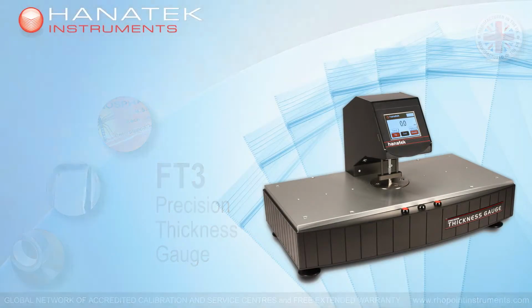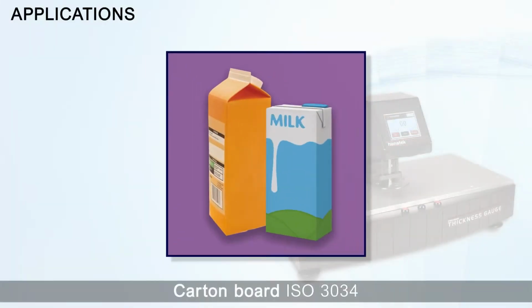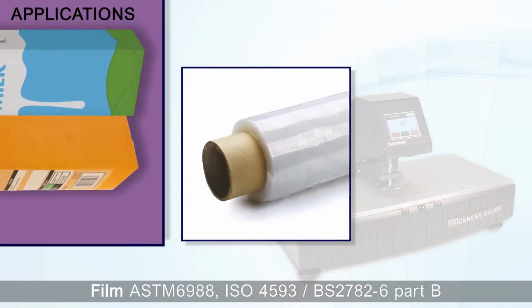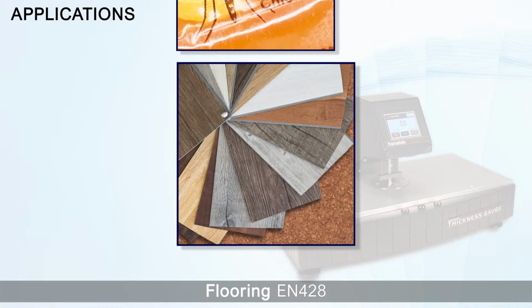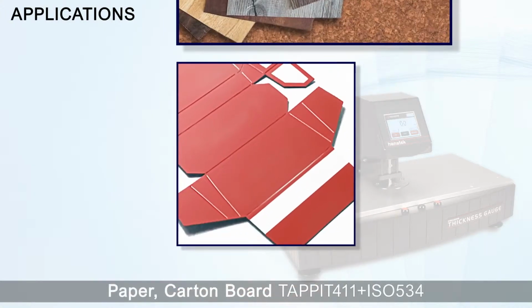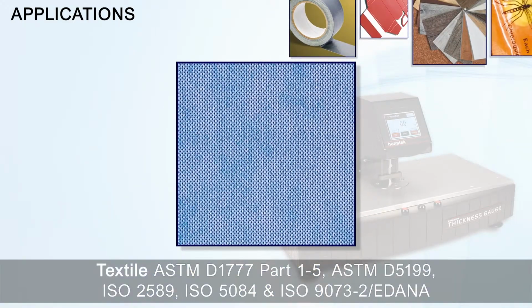FT3 Precision Thickness Gauge. Accurate and repeatable thickness measurements. Compliant to multiple standards. Choice of configuration. Applications: carton board, film, flexible packaging, flooring, paper and carton board, tape, textile, tissue.